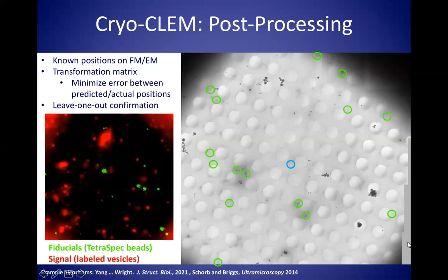But more importantly, this gives you spatial knowledge of the error, because you can imagine this grid square here is a 25 square montage. And you can imagine that there might be some stitching issues in there. So in addition to the normal movement of things on the grid due to handling or breakage, we now also have to contend with the fact that there is alignment. And so this gives us the knowledge that everything in this area has a certain degree of precision that might differ from things in another area of the grid.